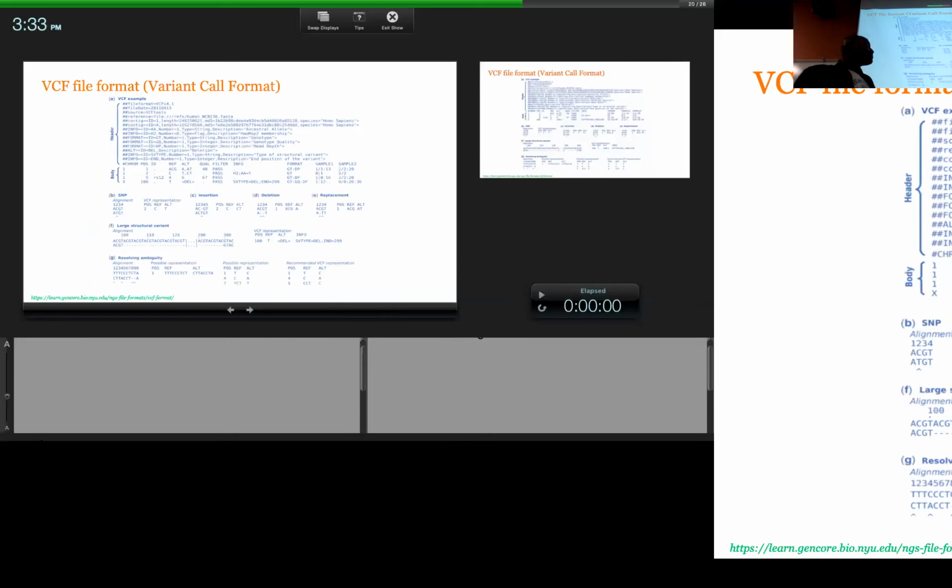All right. Once you're done with the pre-SNP calling, you're going to perform your actual SNP calling. And I think at this point, most programs will generate what you call a VCF file. And the VCF file does look scary. It's got all this information, right? Some of it is empty information, like, do you have phasing information?